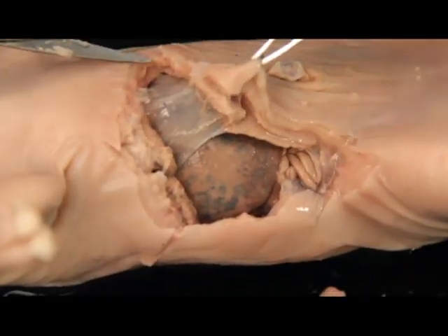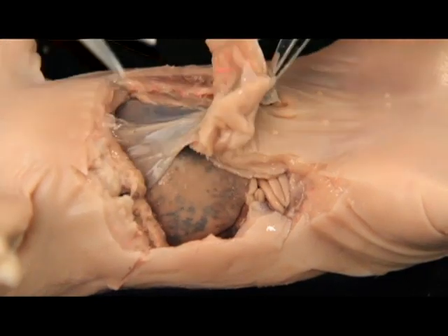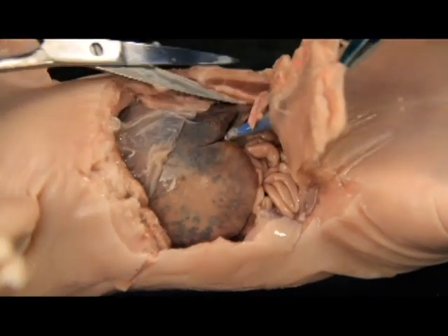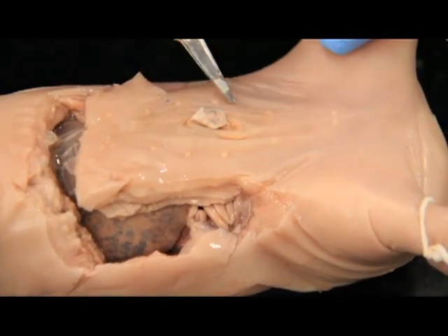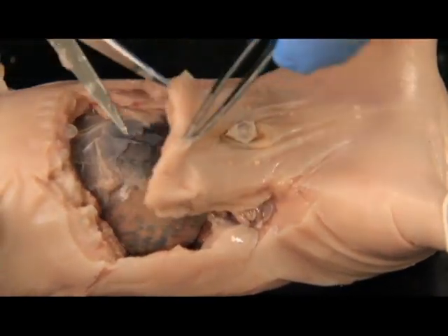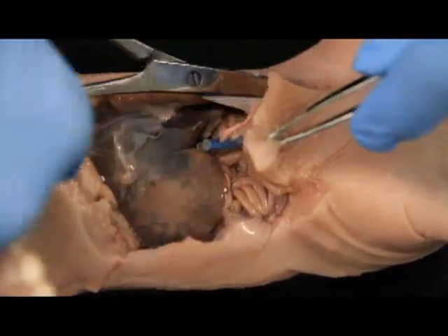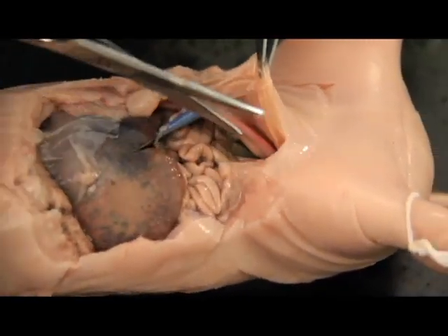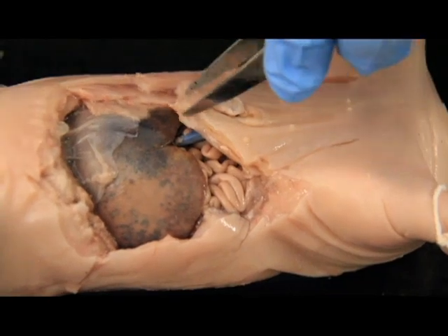These are fetal pigs, so they should cut off very easily. Again, we've got more of that diaphragm right there. See, and we can just cut right in there and expose all this good stuff without harming anything. And again, I've got a male here, so I'm going to cut around this flap. If you were cutting a female, you would simply cut around this umbilical cord, leaving the umbilical cord attached, but removing all this excess skin around. So we want to remove this excess skin, leaving that flap nice and intact, just like so. And remember, you guys want to go very slowly, much slower than I'm going. I've done this a few more times, so don't go as fast as I go.